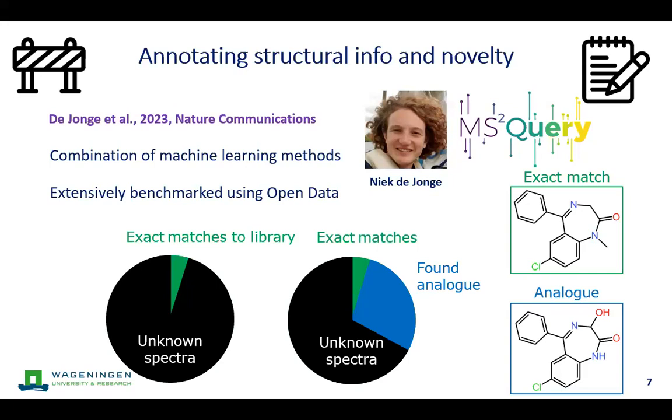We have also seen that the cosine score used in molecular networking in GNPS is the modified cosine score. That means that if there's only one modification, it can typically still find a good score. But as soon as you get two or more modifications, the modified cosine score also gets into trouble. That's why these alternative methods can become complementary and find more or alternative analogs.